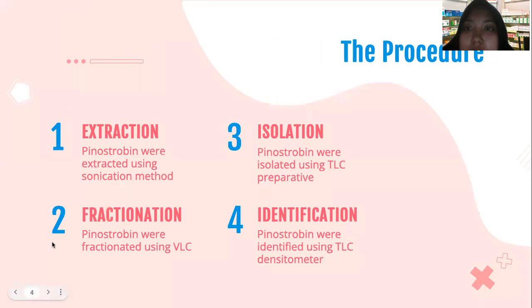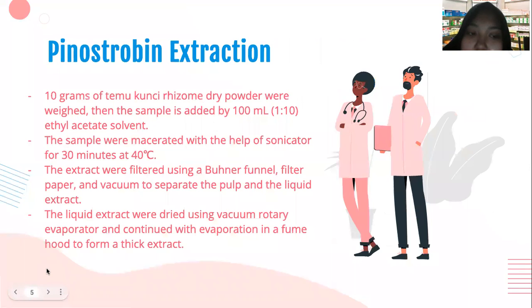Next. This is the procedure. First, extraction was performed by the sonication method. Fractionation was done using VLC. Isolation using preparative TLC and identification using TLC densitometer. Next will be presented by my friend.